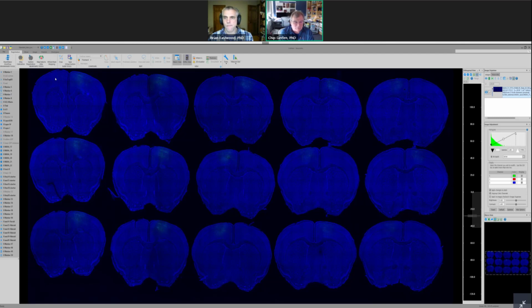What we do with our workflow is that we go through and we image, and then we take the images where the stitching has not been put together, where the tiles have not been put back together. Those are put back together through a separate step, and that can be done offline. However, some microscopes, like I know the Zeiss AxioScan, when it images, they have the equivalent of a deep focus algorithm or tool that's run on that, and that can be done on the fly. It depends on the particular microscope that you're using.